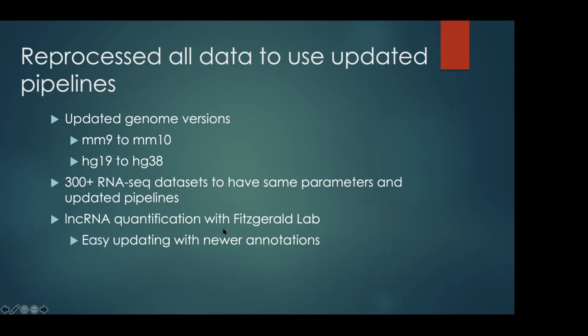I also helped with this Fitzgerald project that had lncRNA quantification. They used external resources to do the initial analysis, and they updated their lncRNA set and wanted to do exactly the same analysis again. They just sent me the lncRNAs. I spent a couple of hours, 1 or 2 hours, to add those RNAs, quantify, and give the results back, and saved a lot of time and resources, I guess.